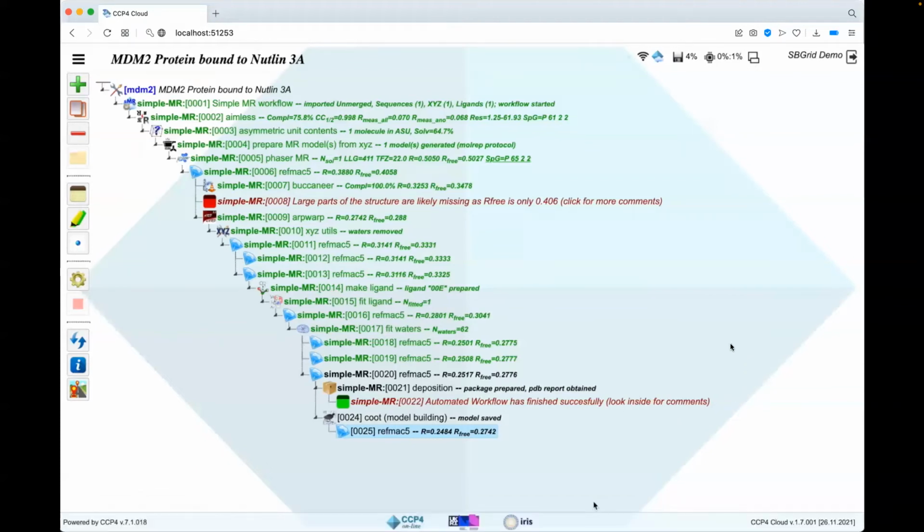Another possible course of action, suppose that you start project in auto start mode, run it, but then you want to rerun a particular part of it with modified parameters, because all these jobs were run with some parameters. You were not in control of it. The workflow decided on the parameter, but you can override the automatic choice.